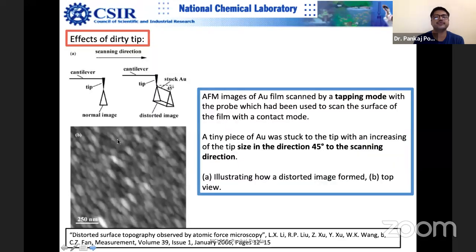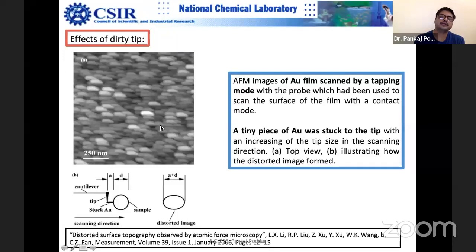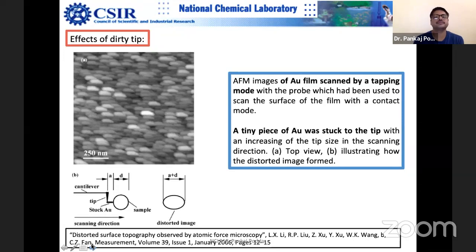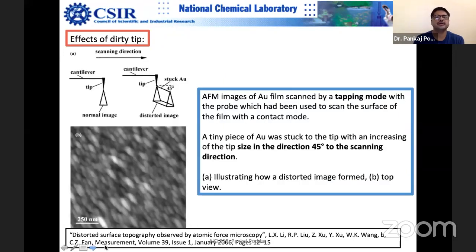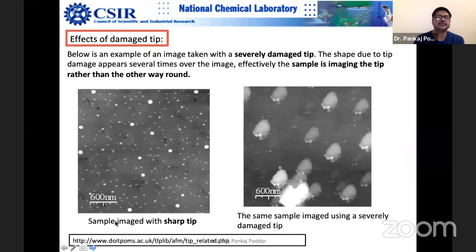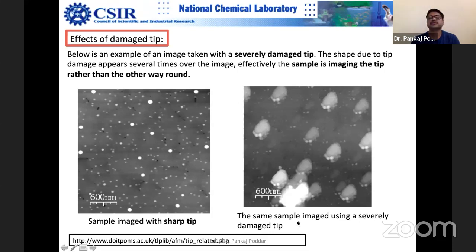The quickest way to check is to rotate the sample during imaging. If the features also rotate, you can publish — otherwise you have to discard the image. There is one sample imaged by a sharp tip showing various kinds of particles with nice dimensions. But if you take a severely damaged probe, you can see similar structures with the same copies repeated, confirming it is badly damaged. You see large structures and then multiple identical dots.